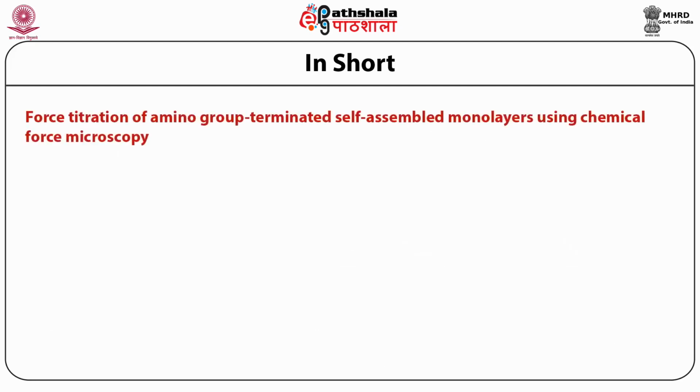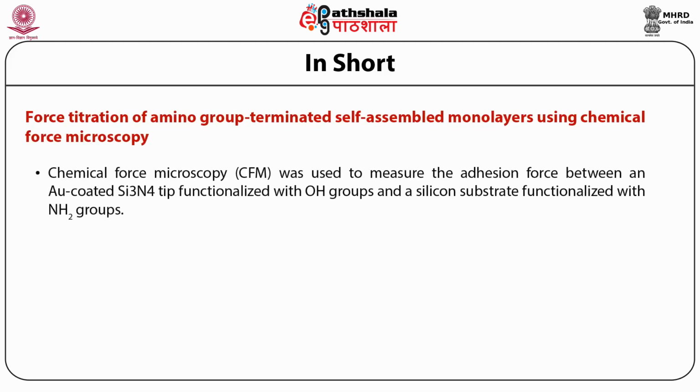Force titration of amino group terminated self-assembled monolayer using chemical force microscopy can be very properly carried out. Chemical force microscopy was used to measure the adhesion force between the gold-coated Si3N4 tip functionalized with OH groups and a silicon substrate functionalized with NH2 groups.